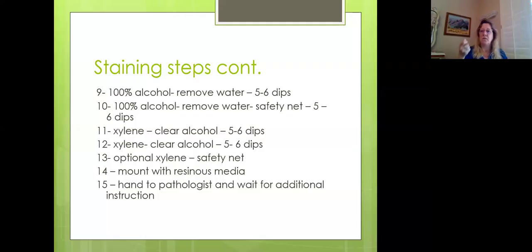And don't muck around with your coverslips. Don't try to wipe the back. I mean, of course, walk the dog, wipe the back of it. Take a look. If you can quickly get a bubble out, great. If not, leave it alone.